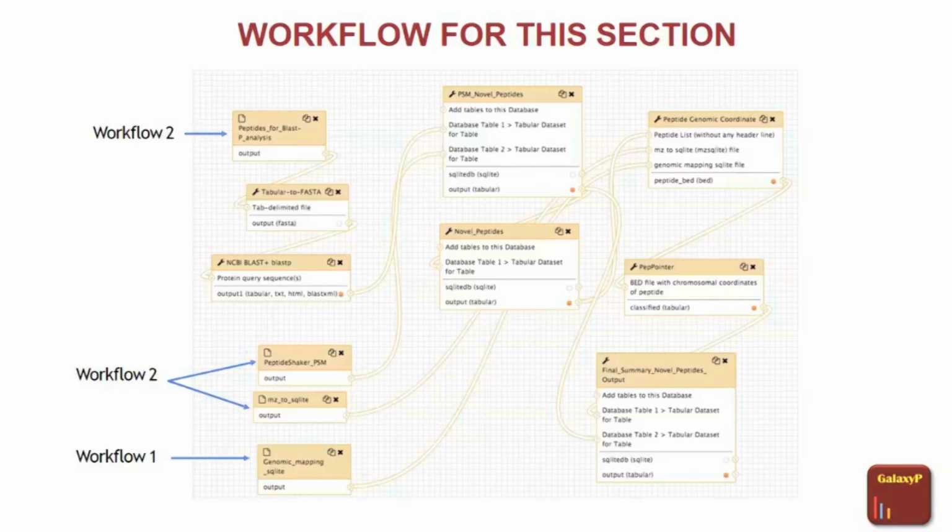If my software is not giving me an mzIdentML file, from where should I convert my raw data to an mzIdentML file? If you want to use the next tool, which is the ability to look at the spectra, to view your spectra, then you should have an mzIdentML output in general. And there are many software that do that: Scaffold does that, Protein Pilot does that. I'm sure Proteome Discoverer does that, though I haven't used it. mzIdentML is quite a standard output nowadays that most of the software generate.